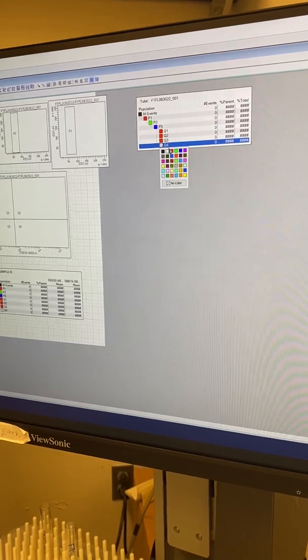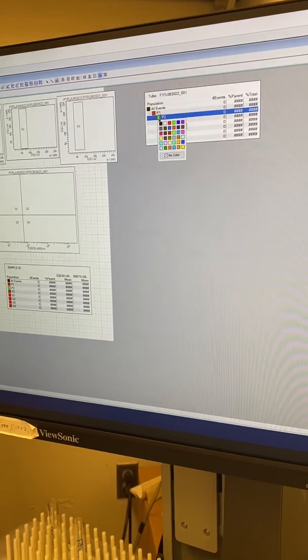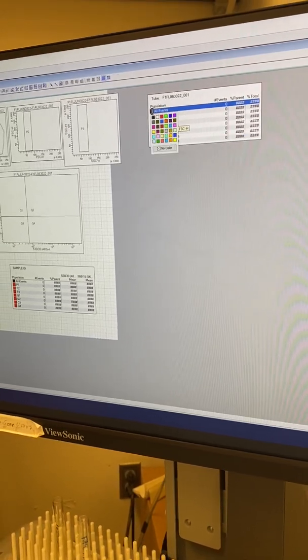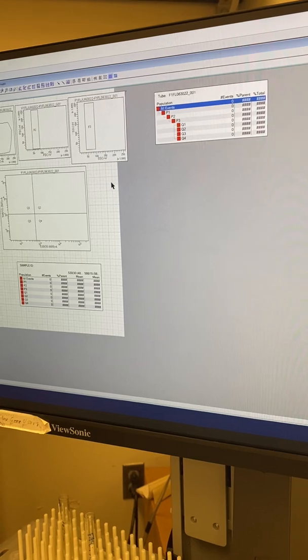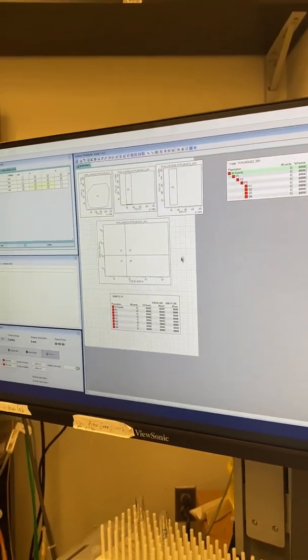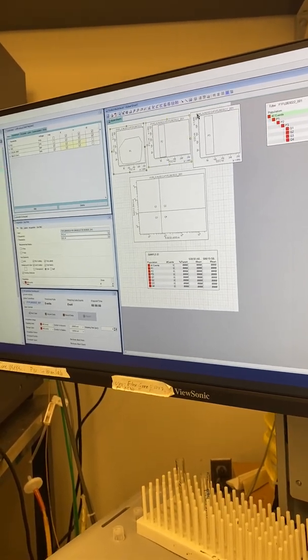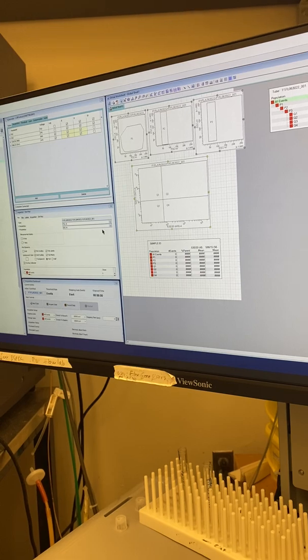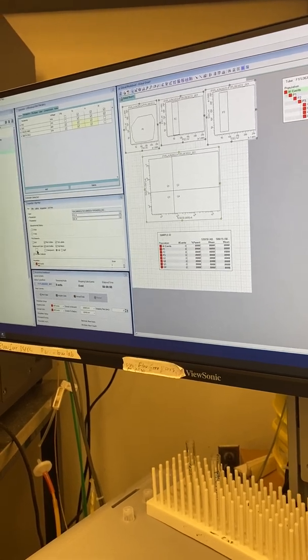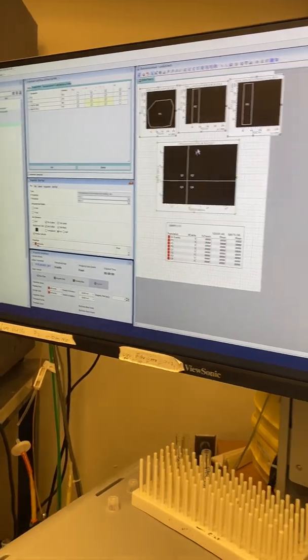From our experience, red on a black background is very appealing, and it prints very well, although people tend to take the data back to their lab and analyze it. So I'm going to highlight a plot, and then I'm going to hit the shift button, and then click each subsequent plot, and then go over here to the middle for the background color, and there's a bunch of colors you can choose. So I'm going to choose black.